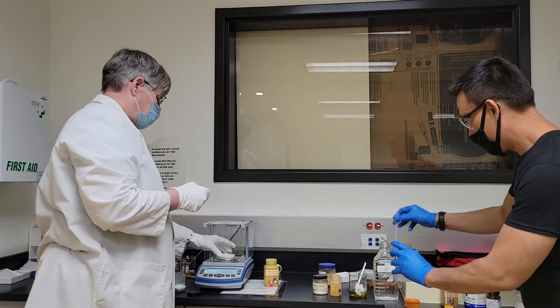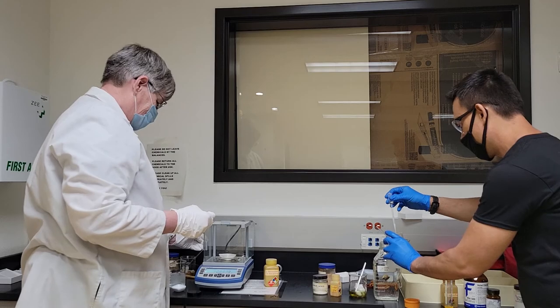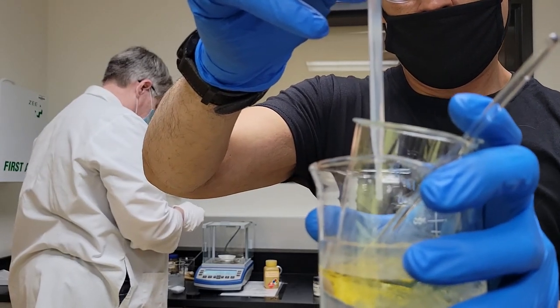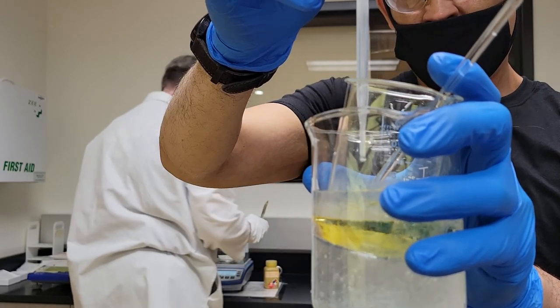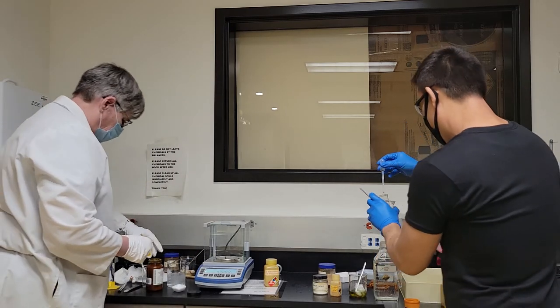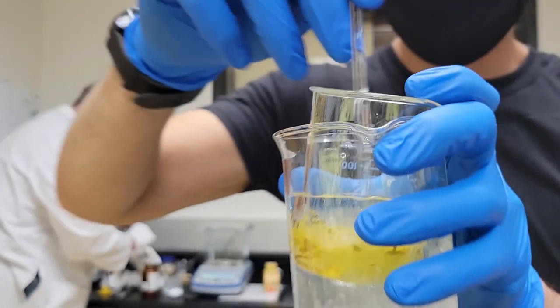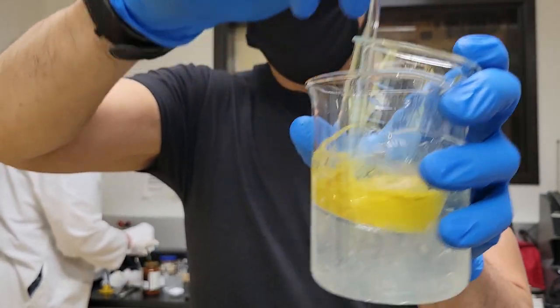Normally we use a fume hood for the concentrated HCl, but we're doing it out here for the sake of the video. This is not safe today. About 20 drops — 20-ish, like 21, but yeah. Ice it now, stir it around, try to create a slurry. This stuff's not going to fully dissolve. You definitely want it in a slurry for when you dip your cloth into it.